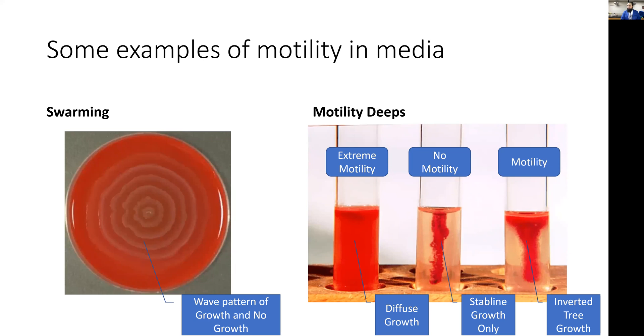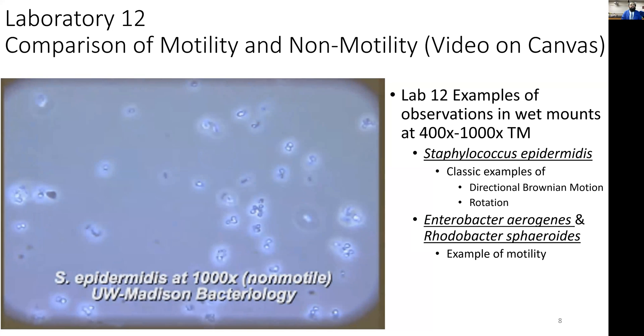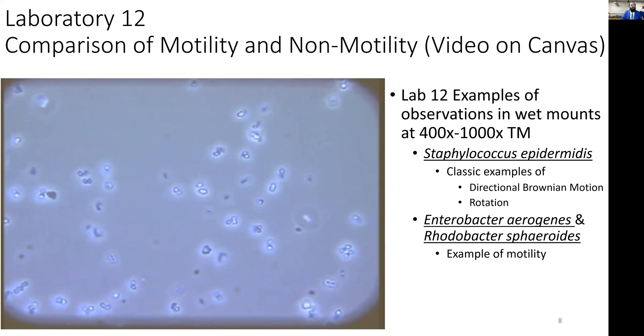Here we have a video showing Brownian motion. You can see everything moving in the same direction—that's not real motility, just a current and vibration from the earth, table, and possibly breathing. This is a different organism, Staph epidermidis. They're traveling all together, not in multiple particular directions, just flowing with everything there. The organisms tweak around and rotate on their axis, but they're not swimming in a particular direction—the water is carrying them. This is Brownian motion.